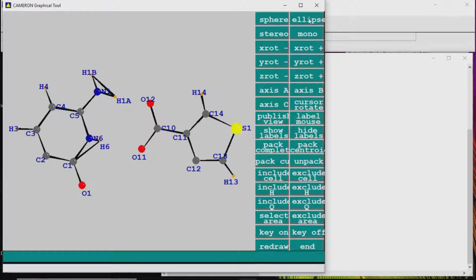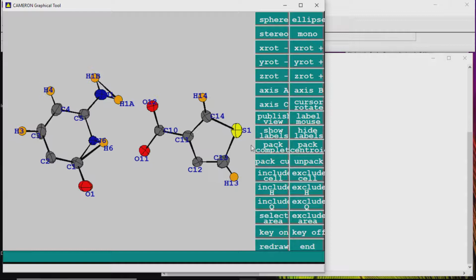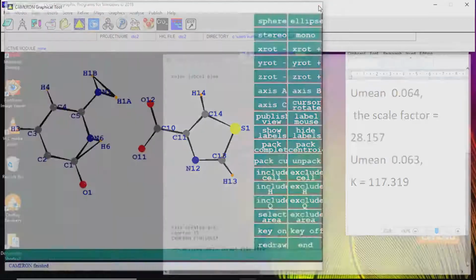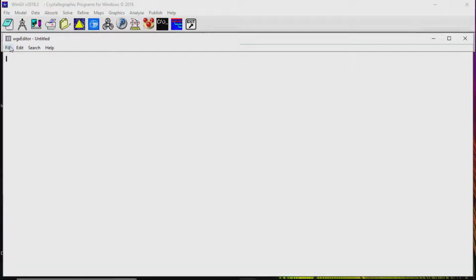Sphere. Same thing in this one, here C, then expected is this is supposed to be N. Rename N12. Okay. So sphere, exclude Q's, end, close it. Now open it.